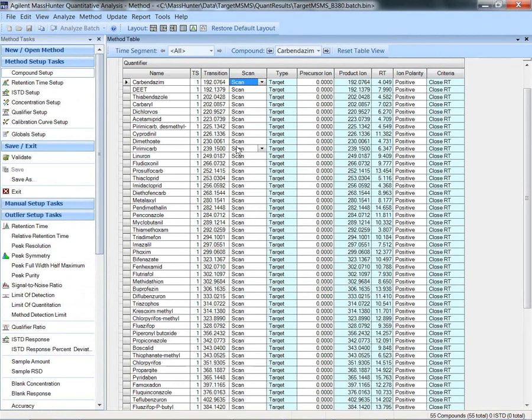And first let me say, I put this in the expert category. There's a number of steps. First let me make the point that the quantitation is done against the scan data. So you see the scan with the assignment of the product ion, not a precursor ion. So this is not an MS-MS from the point of view of quantitation.